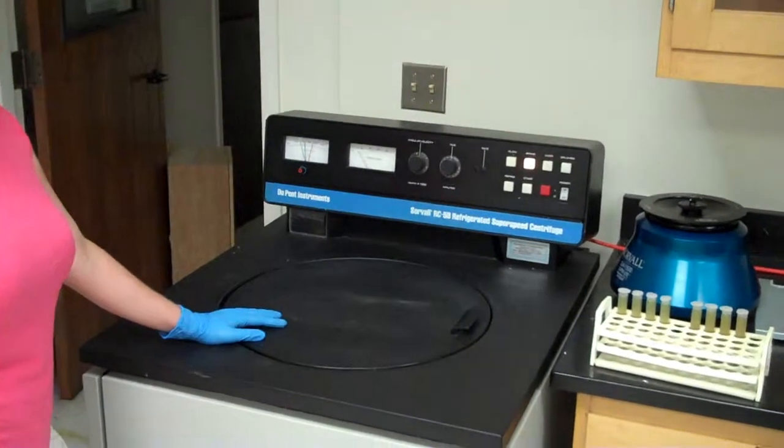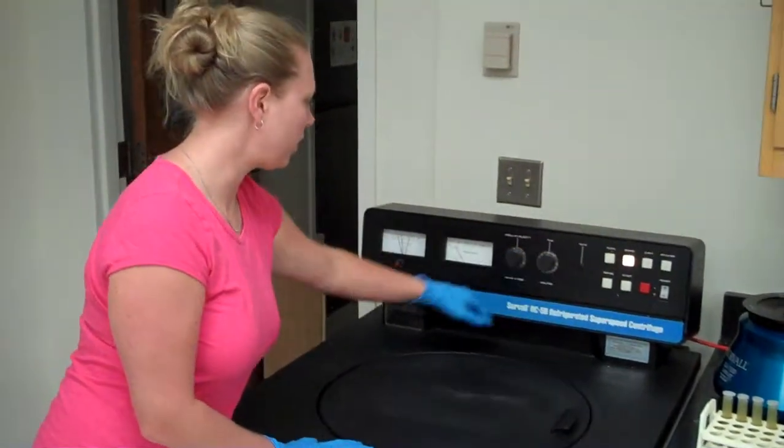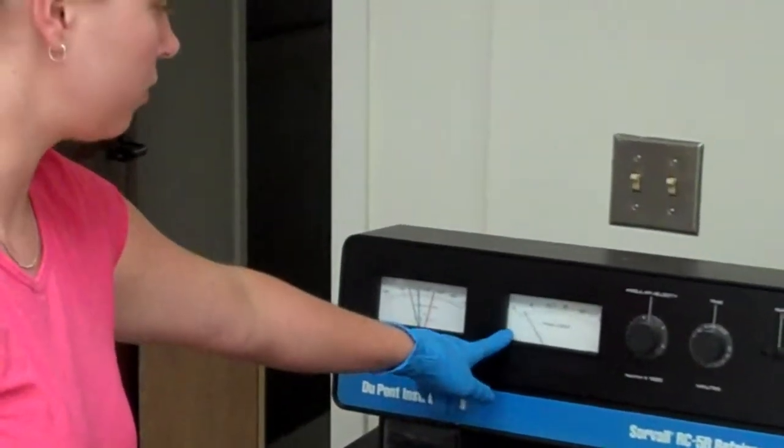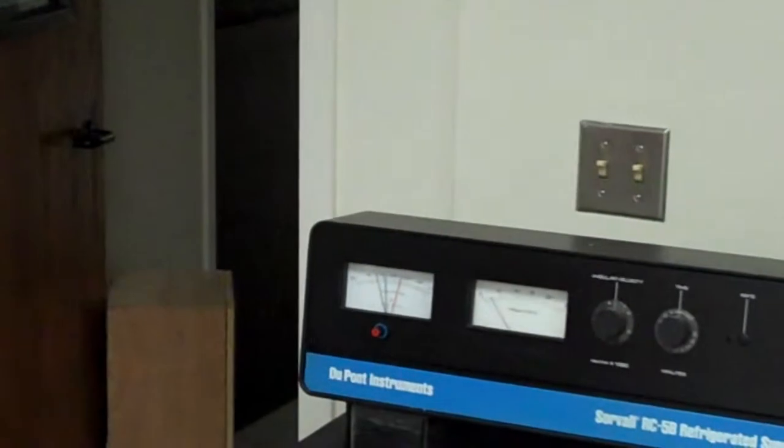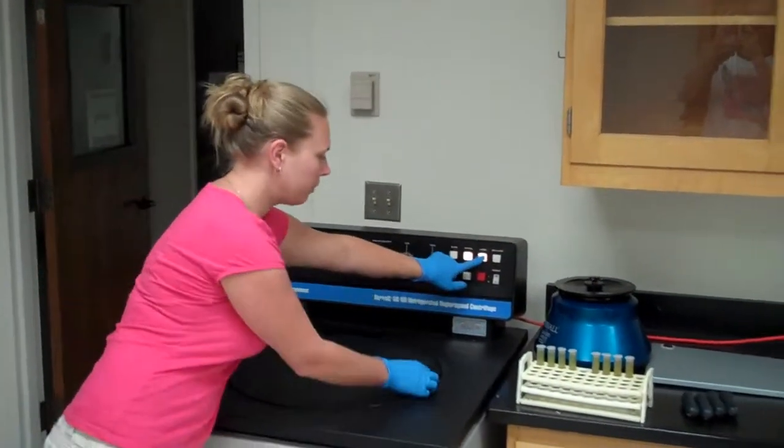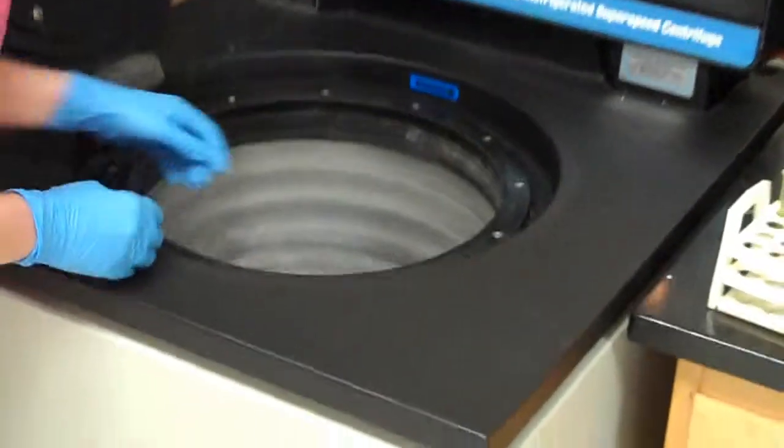So we're ready to load our samples up. We turn the timer to stop and wait until this dial gets down to zero. The centrifuge will not open until it's at zero. Once the centrifuge has stopped running, push the door button, which opens up the centrifuge.